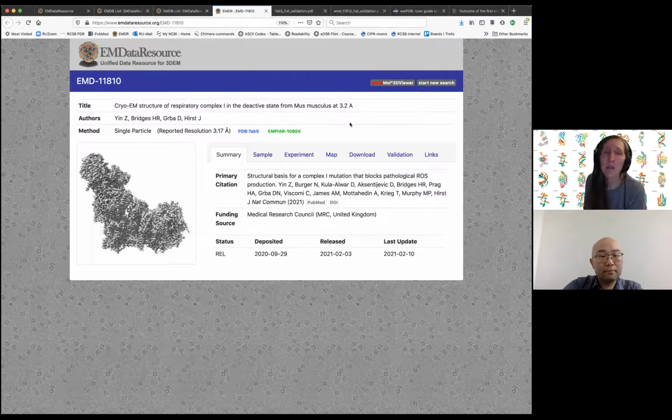following annotation, because they look to see if it needs corrections. Apparently the ligand is the most problem. If you have ligands, it's going to take longer. If you don't have ligands, then the annotator will be very happy and will be able to process it in a very short amount of time, like an hour or so.